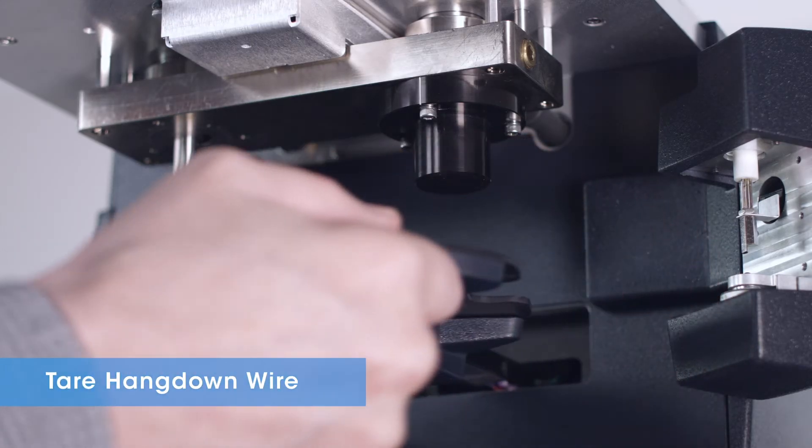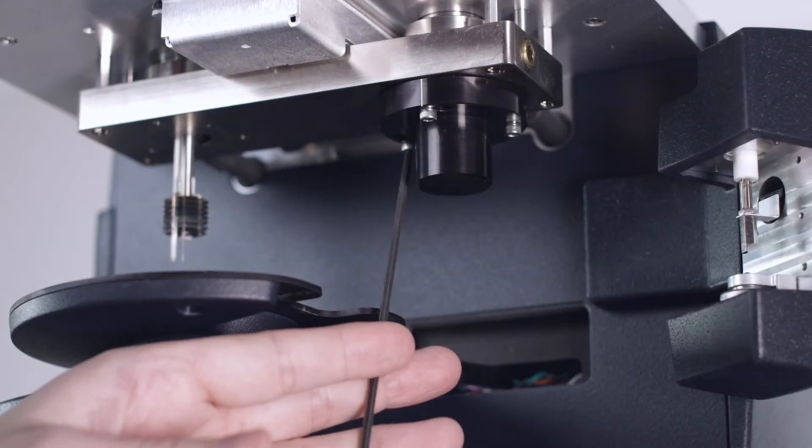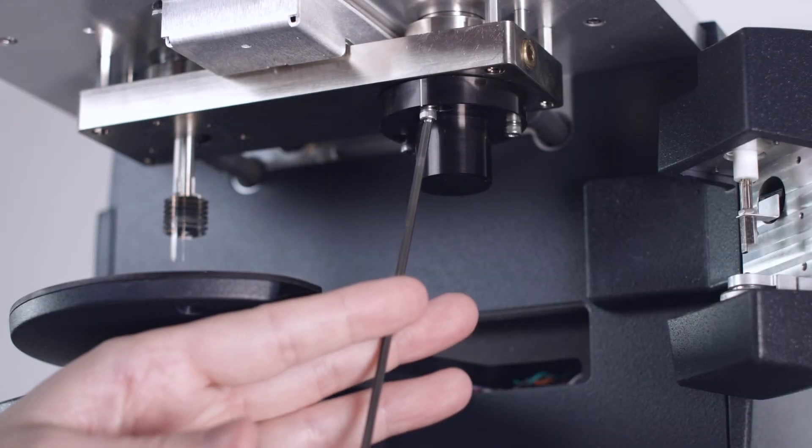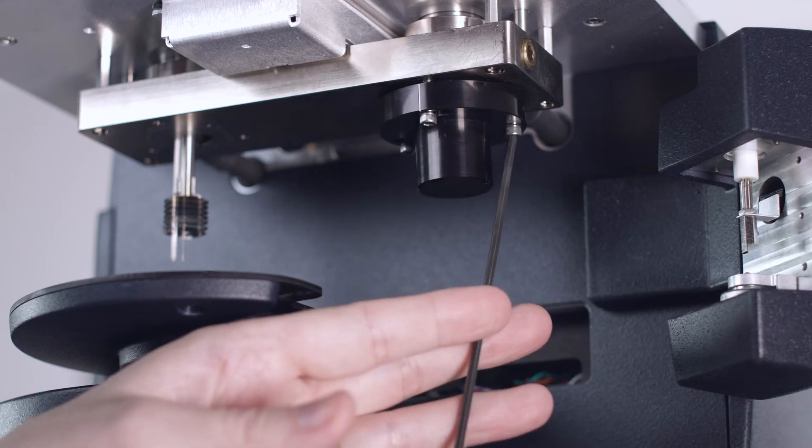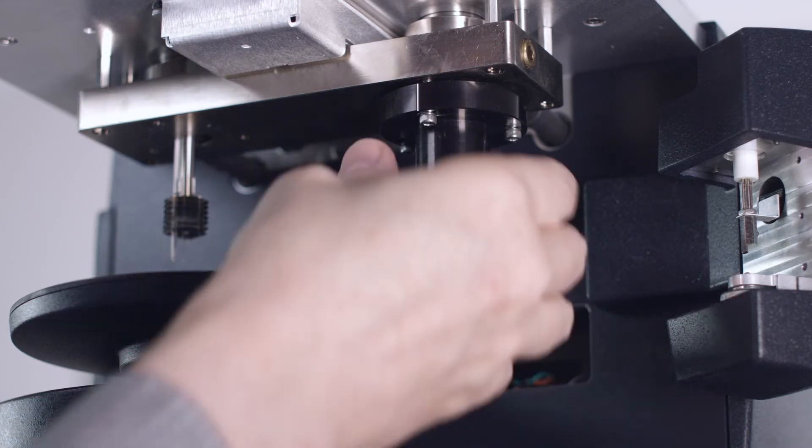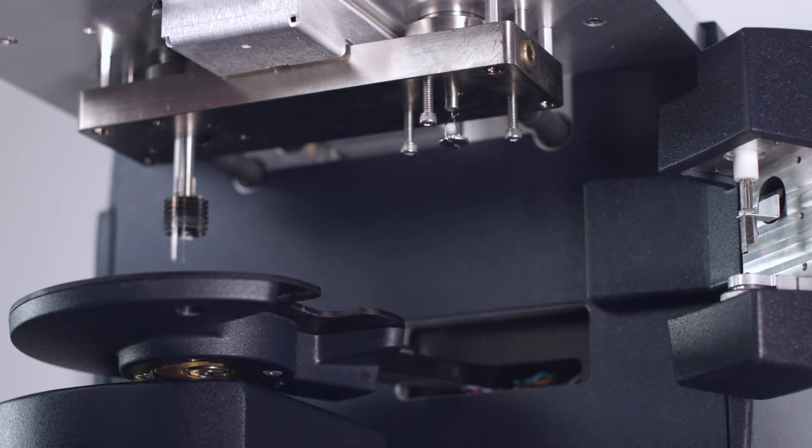To remove the tear hang down wire, first using the 7/64th ball driver from the accessory kit, loosen, but do not remove, the three screws holding the tear cover in place. Rotate the tear cover clockwise and lower it.